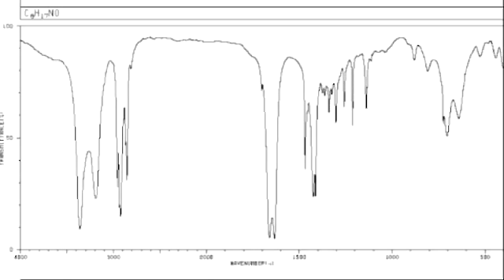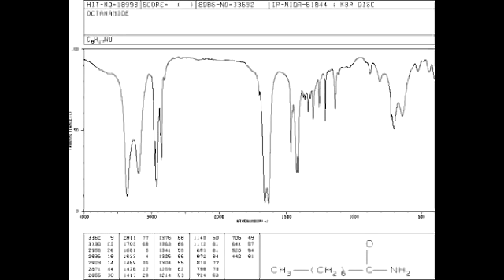And those two peaks to the left are actually two H's that are off the N, like it would be for an amine. Okay, so looking now at the molecular formula and the name, we can see that we are in fact correct. It's an amide with two N-H's, and we know it must have had two H's because looking at 3400 and 3200, there are two peaks and not one, and therefore there are two N single bond H's. And we can see that the amide group does absorb kind of like a double carbonyl, but too far to the right, again between 1600 and 1700.